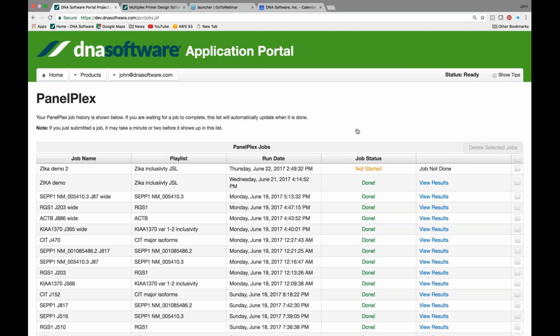In the process, it's folding all of those sequence variants of the Zika virus. It's trying tens of thousands of primer candidates. It's doing hybridization reactions to those Zika viruses. It's checking for all the false positives against all the members of the exclusivity set, the dengue fever viruses, West Nile viruses, all the other things you put in that. It's checking to make sure that those primers don't bind to the human genome. It's a massive, massive calculation. No human could ever do the calculations that are present here.